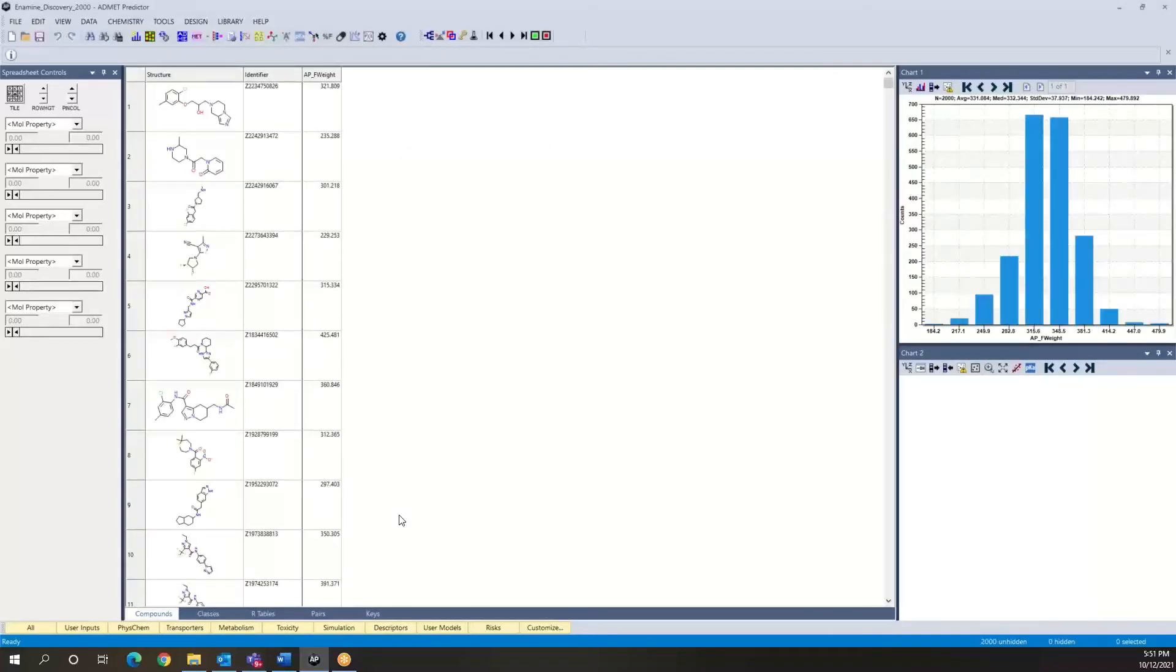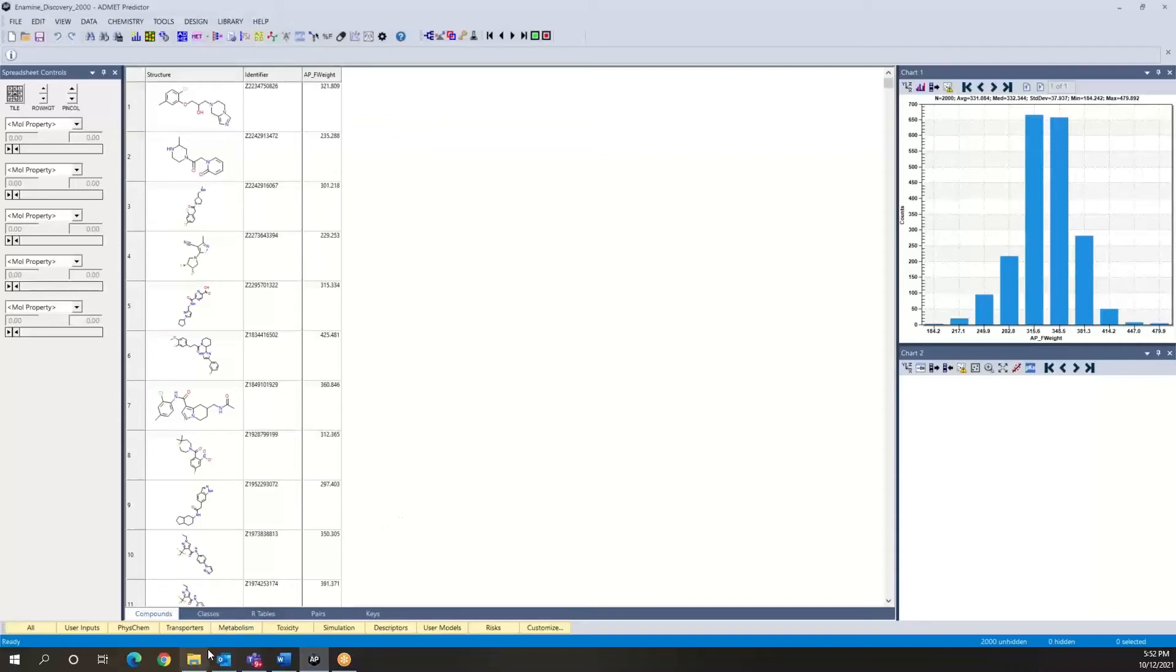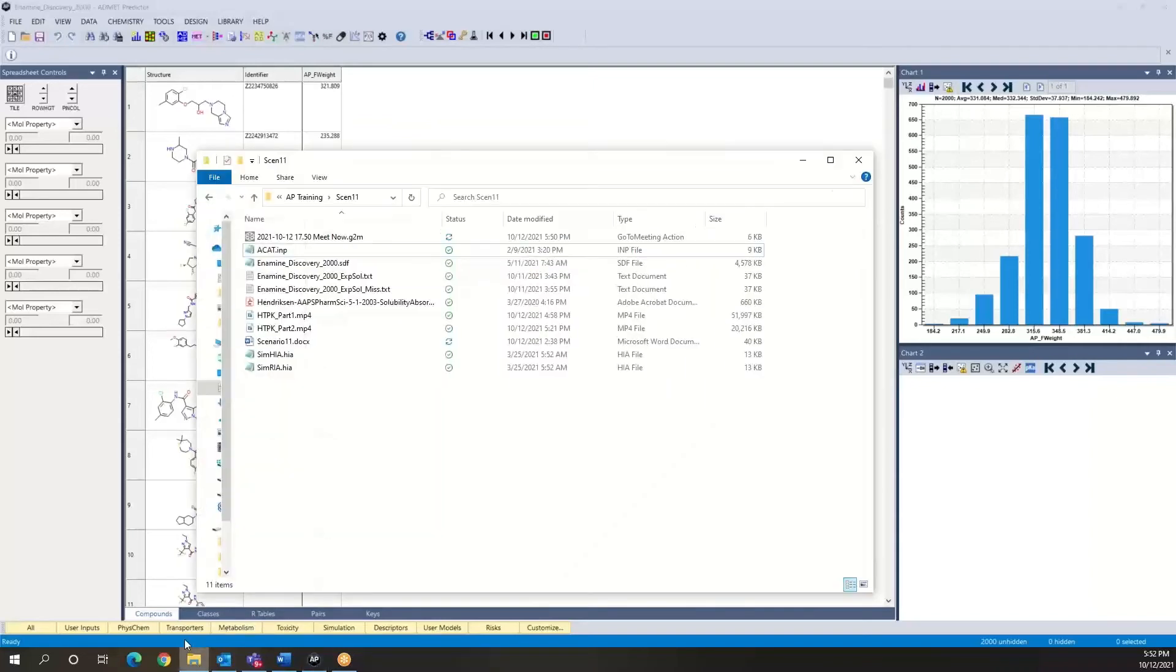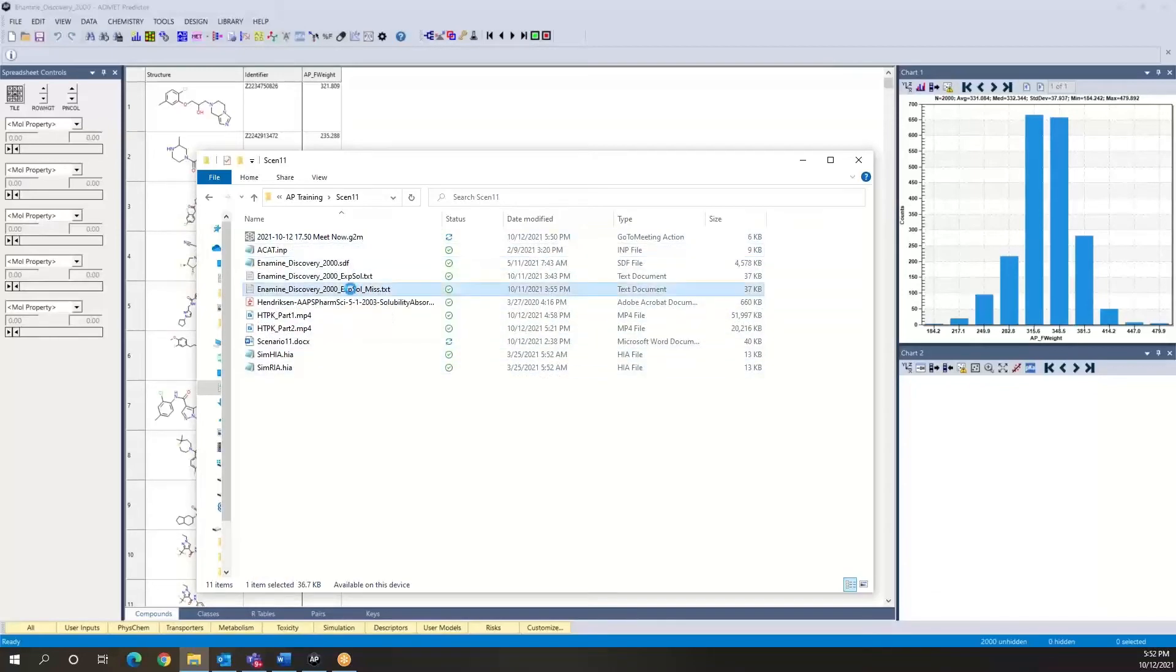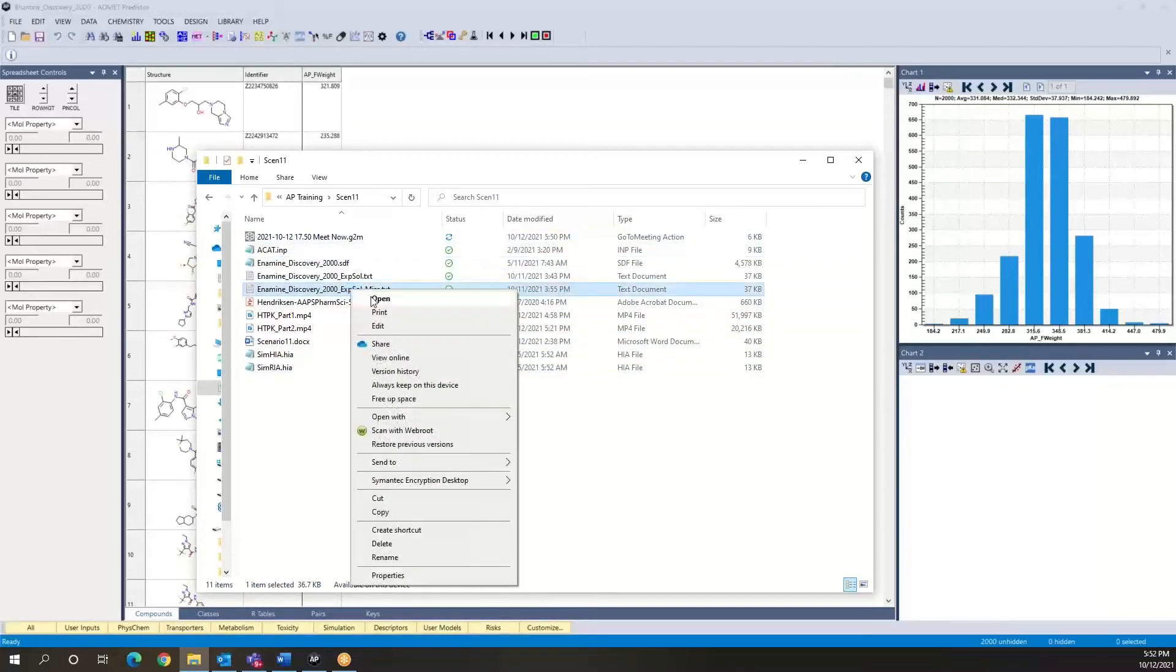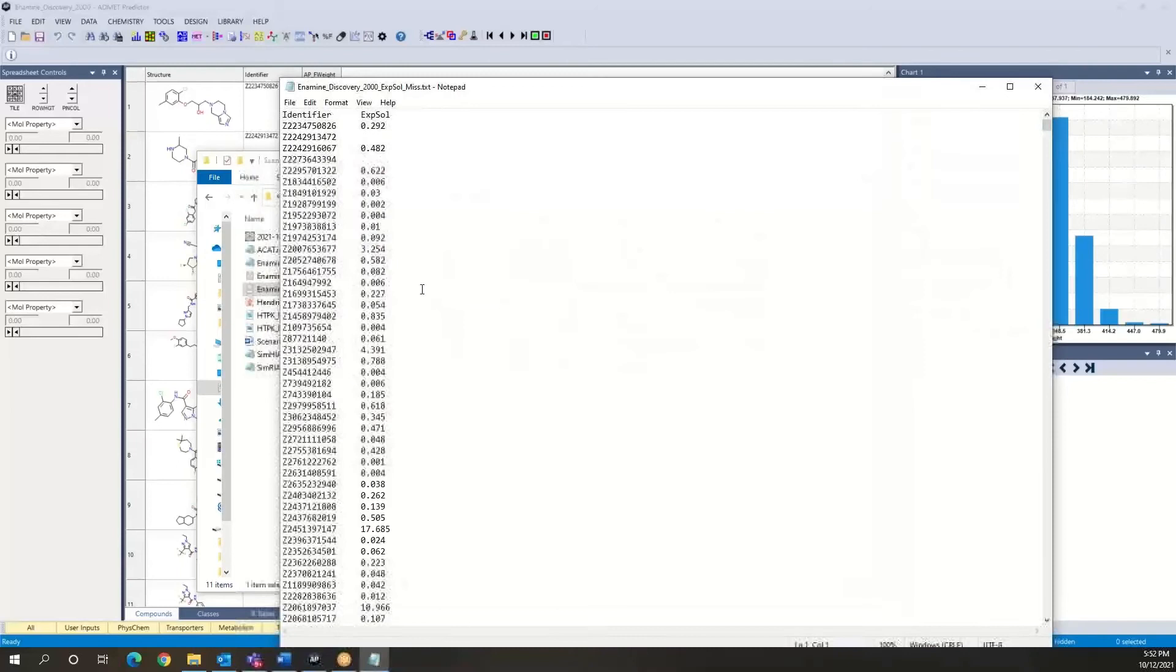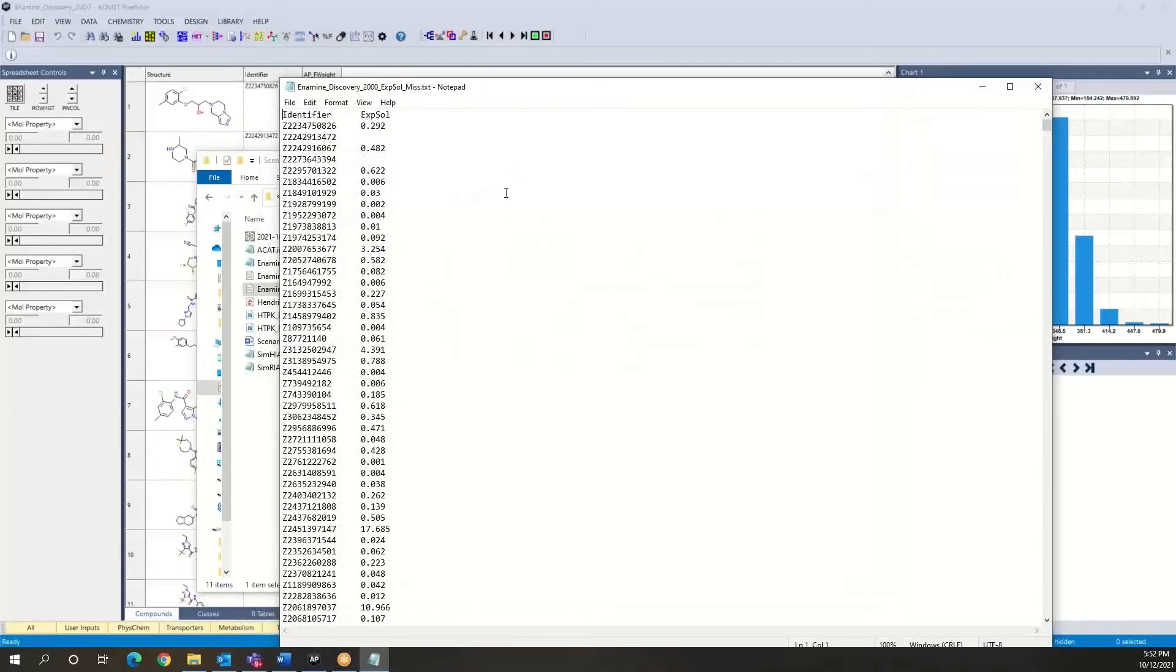And now we're going to hypothesize that we have experimental solubility data for these compounds, and that we want to re-run our previous %FA and %FB calculations, taking this new data into account. So let me first show you what this data looks like and just open it in notepad.